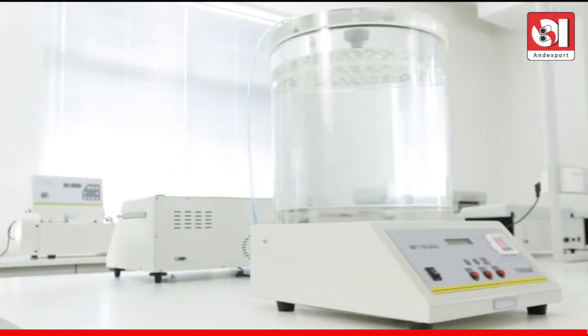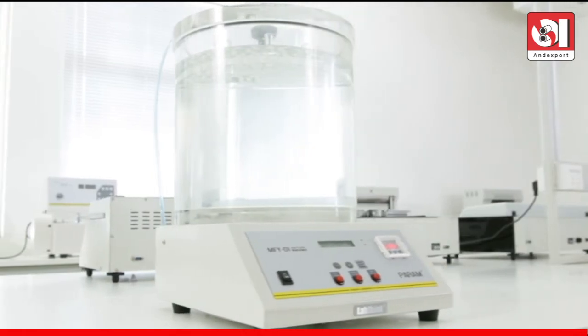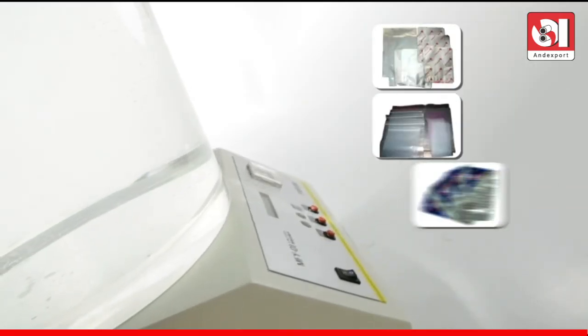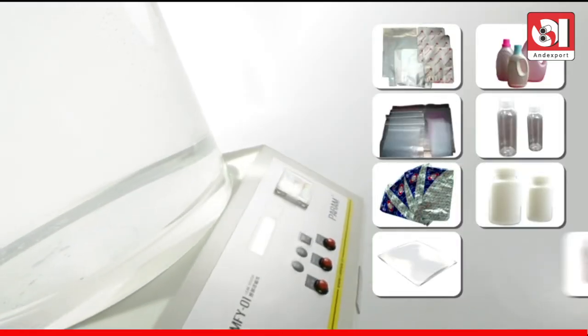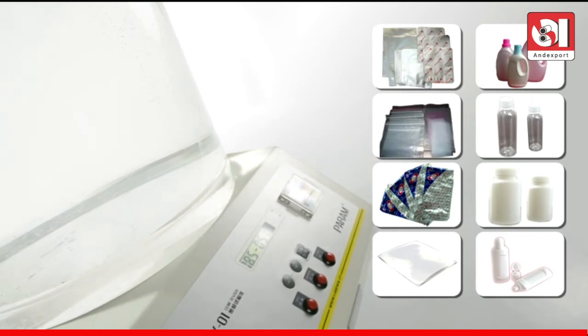users can quickly determine the sealing properties of the specimen. The instrument can be used for leakage testing of pouches, bottles, cans and other sealed packages used in different industries.